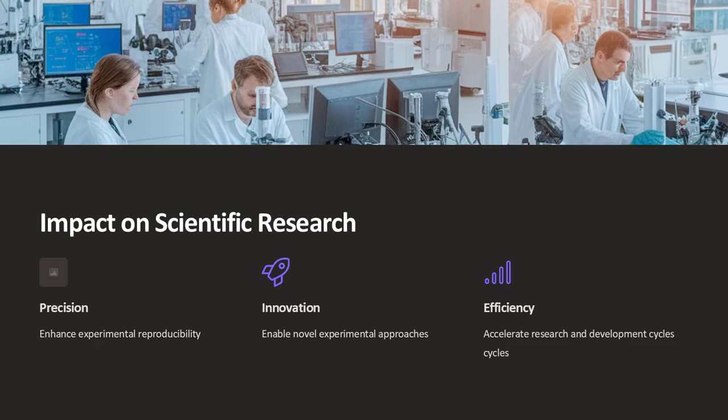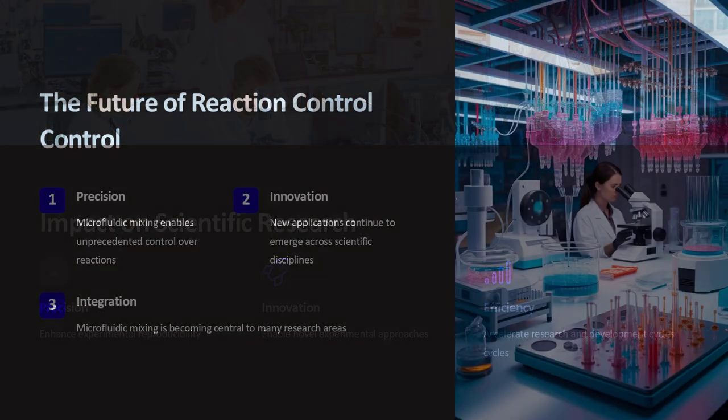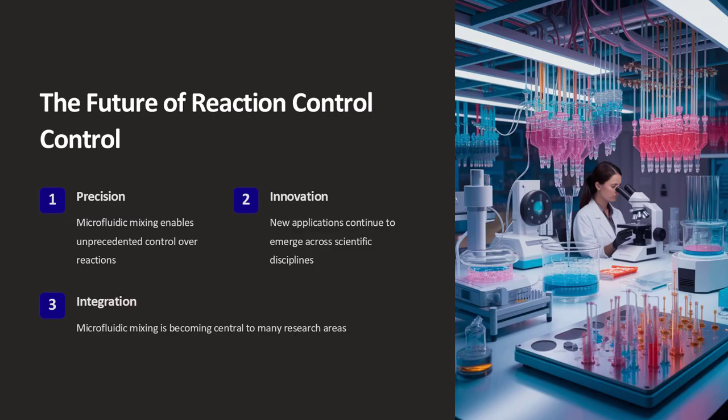Whether it's achieving uniform nanoparticle synthesis, conducting sensitive enzyme assays, or developing multiplex diagnostic devices, the precision and efficiency of microfluidic mixers make them indispensable tools in modern research and industrial applications. The integration of computational modeling, automation, and real-time feedback is pushing the boundaries of what can be achieved, opening up exciting possibilities for future innovations.